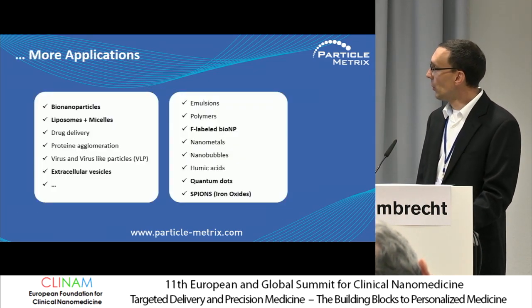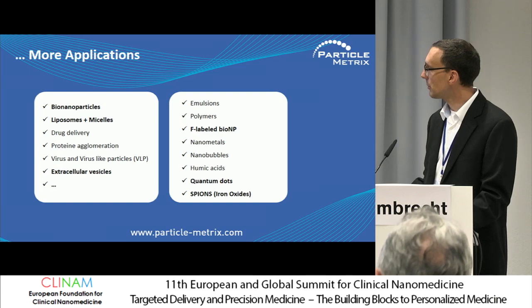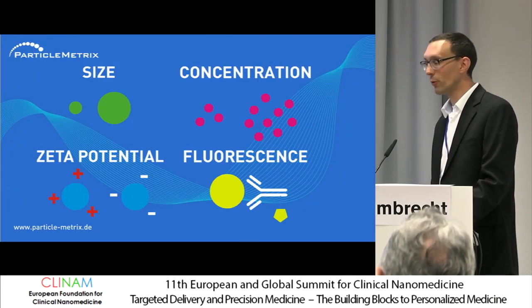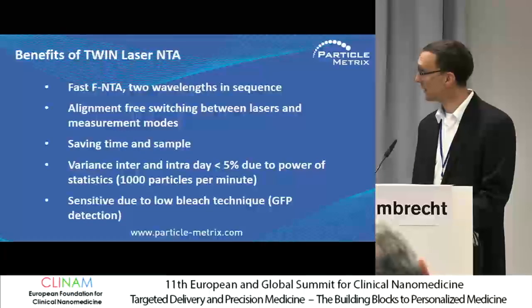And even more, besides the bio-nanoparticles, we go to also the technical products, of course, nanometals, nanobubbles, quantum nanodots, SPIONs, and many more particles. So those are the 4 parameters for NTA: size, concentration, zeta potential, fluorescence.